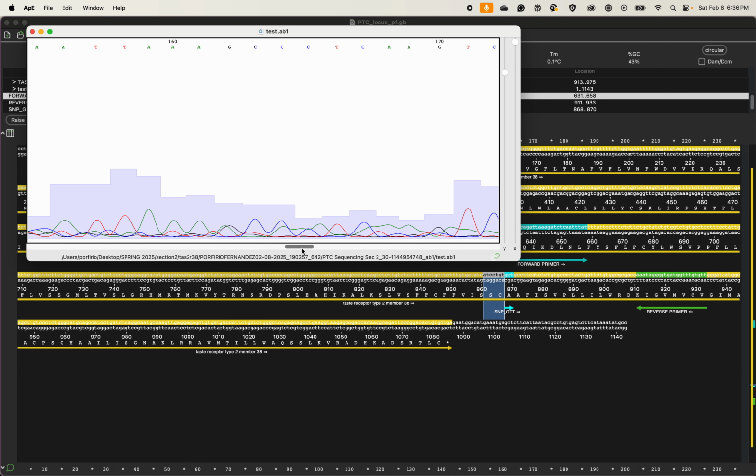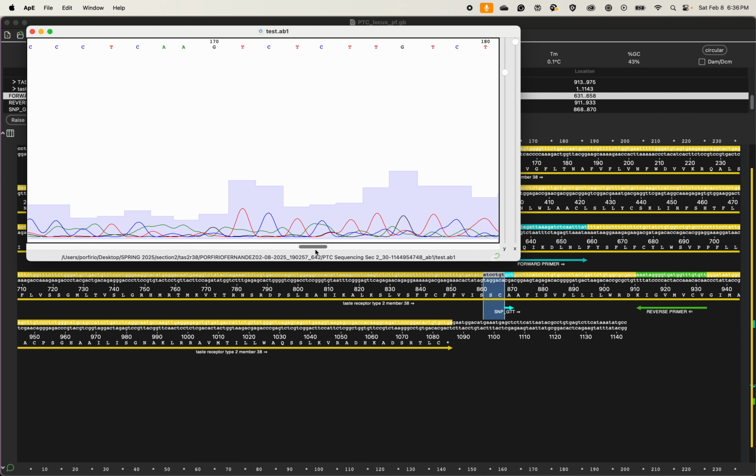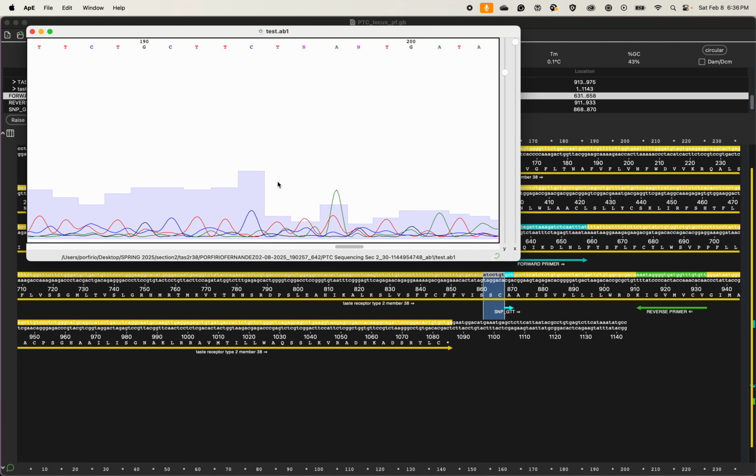And they gave me a detailed report. This one came out as poor sequence quality. But again, what that means is just that the machine sometimes doesn't make correct calls. If you have a poor sequence quality, you can go into the file yourself and look for different nucleotides to make sure it's calling the right bases.